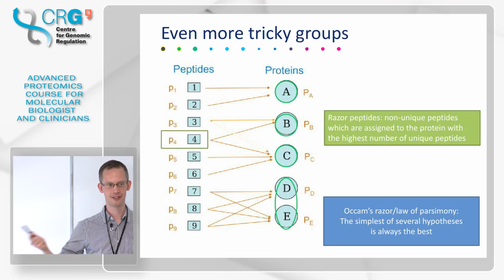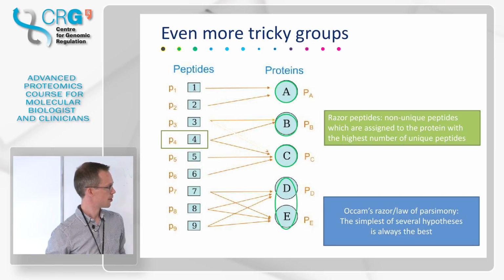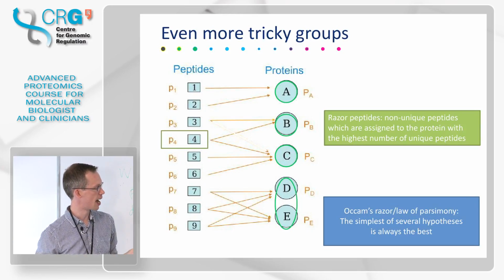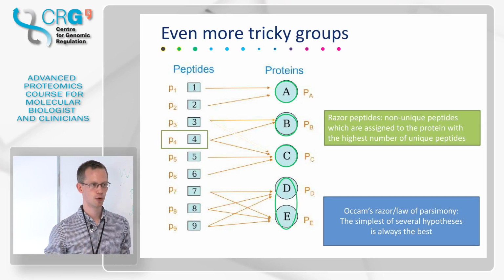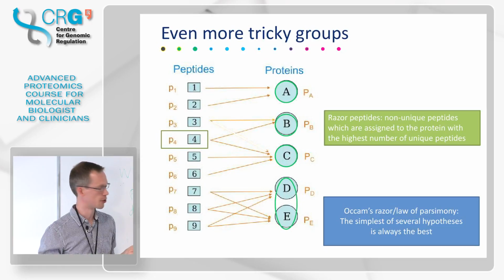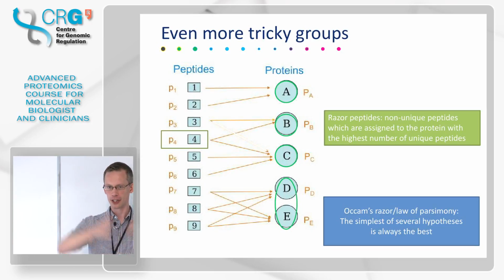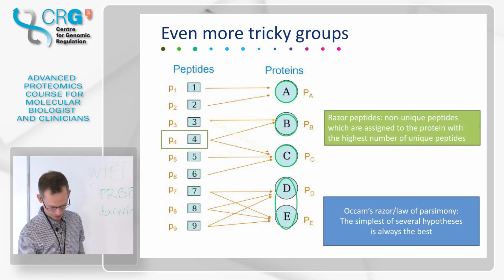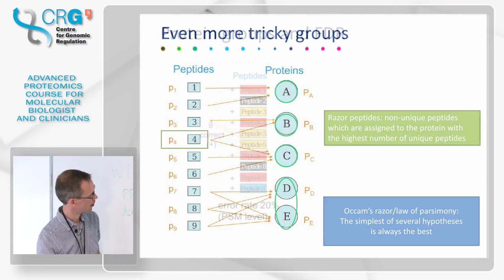So the evidence for the presence of the protein group is coming from the unique peptides. However, you may add some of these razor peptides to the group to increase the quantitative aspect. You can also look at whether, if this is really different from the rest, then maybe it's really not belonging. But often it is, actually. So this usually holds up. And this usually works well for these kinds of global, big analyses. Then these simple assumptions actually work very nicely. That's how it's being done.